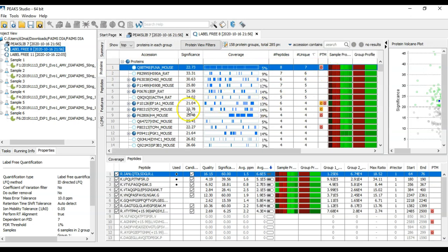That's all you need to know to get started with DIA data and peaks. To try a demo, please visit our website, bioinfor.com.